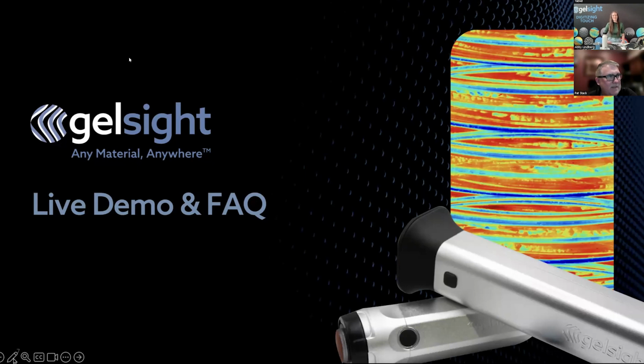A good case is turbine blade leading edges, for example. Sure. Today, obviously, we're talking about surface roughness, but I would say turbine blade edge inspection is a big one of our applications. So inspecting defects along edges of blades, we can definitely do that. And curved parts, also not a problem. If you want to talk a little bit more in detail about your application, we can connect too.